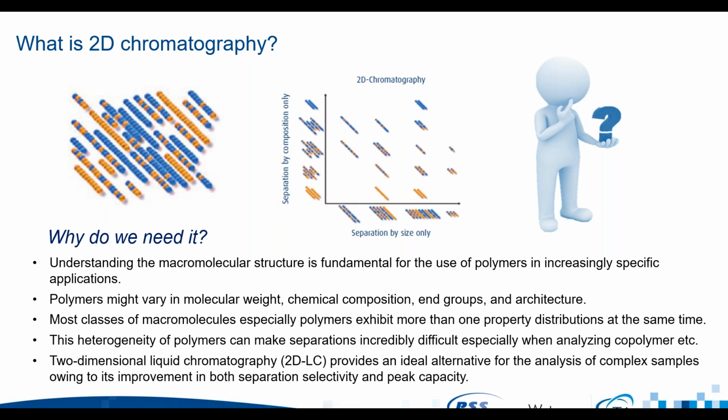So if we look at something with multiple chain lengths and varying compositions, an analysis of this type of sample with what we class as standard GPC type separations, our results are likely to be hindered to some extent by what we call the polydispersity of the sample. So the more stuff we've got in there, the wider the distribution of the peak that we'll get in our chromatogram, and the less information we'll really get from that chromatogram in what's considered a generally low resolution traditional GPC technique.